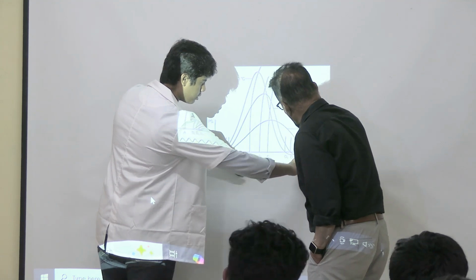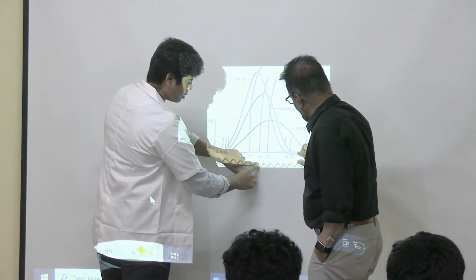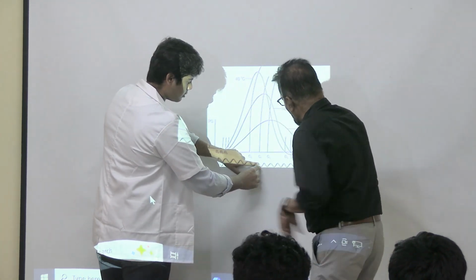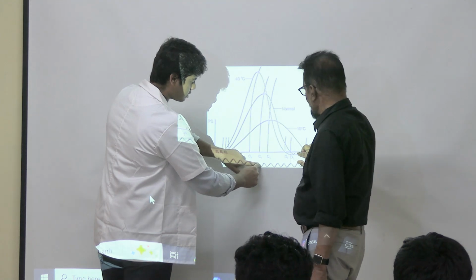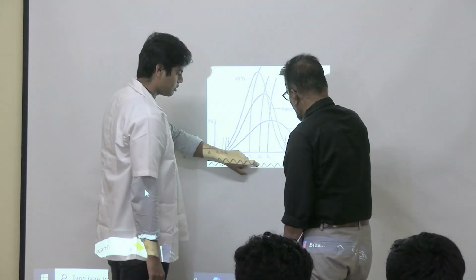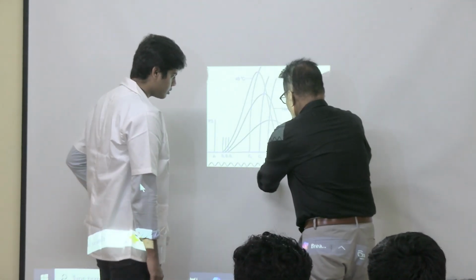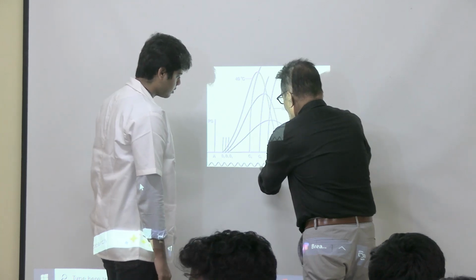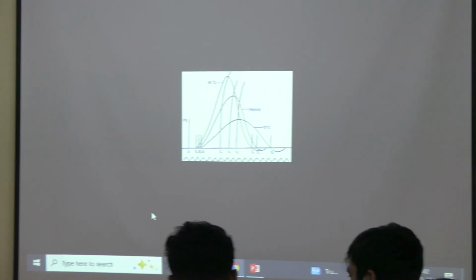This line is touching this line, so it should be this line. 1, 2, 3, 4, 4.5, and this half. 5. Half. If you consider it, this is half. This is 0.75. So 4.75 into 0.01. So this will be the relaxation period. So you got the latent period, relaxation period, and contraction period.